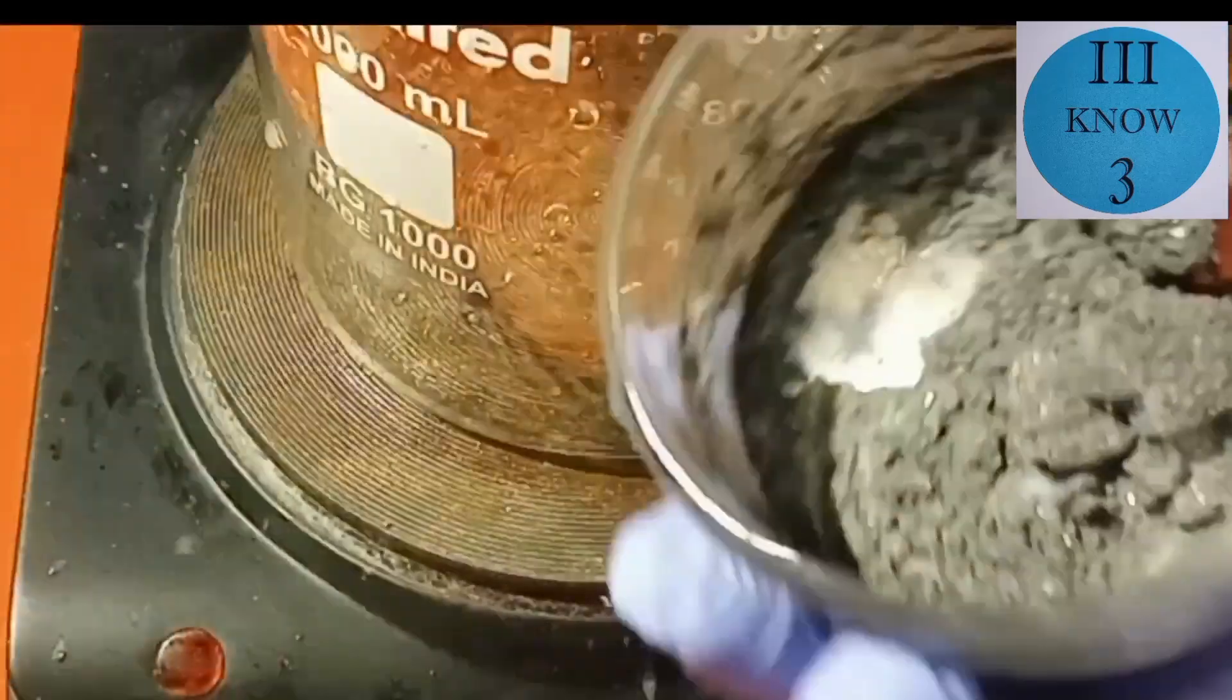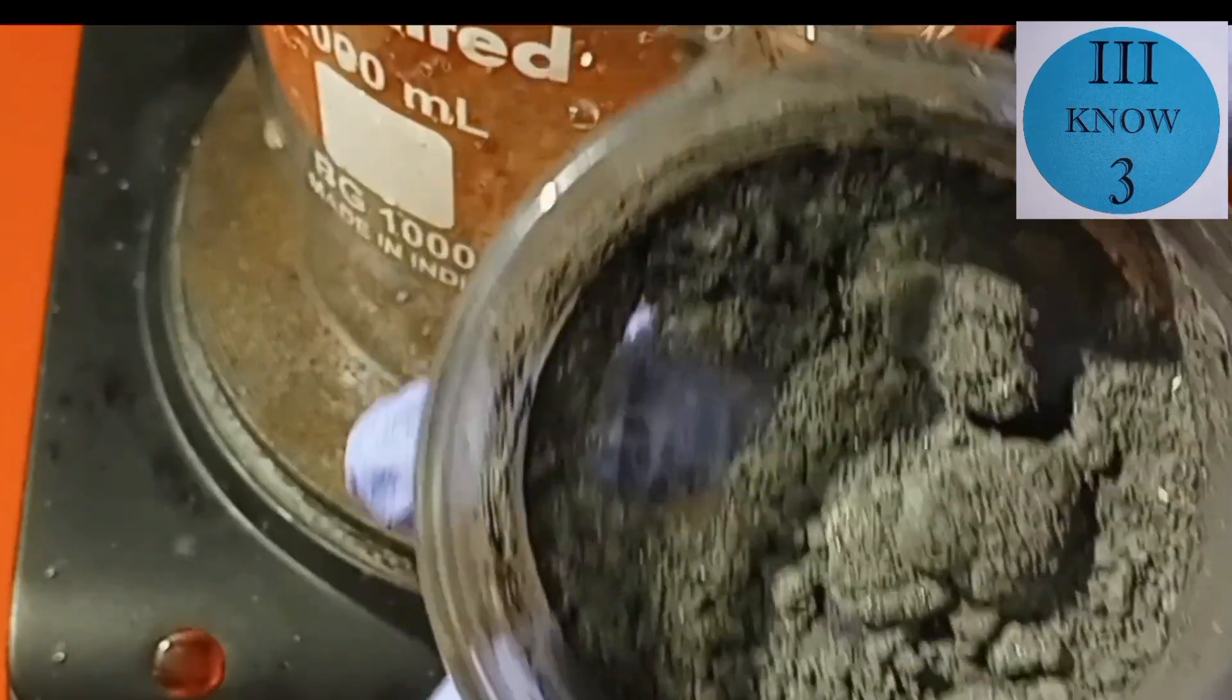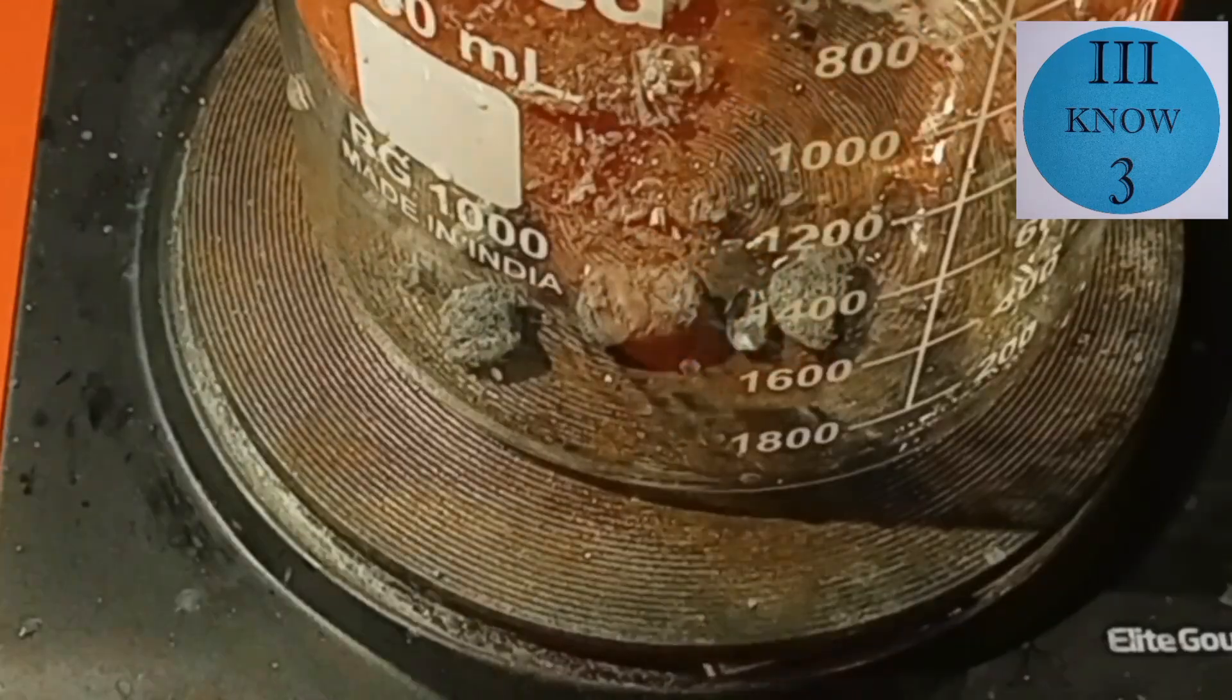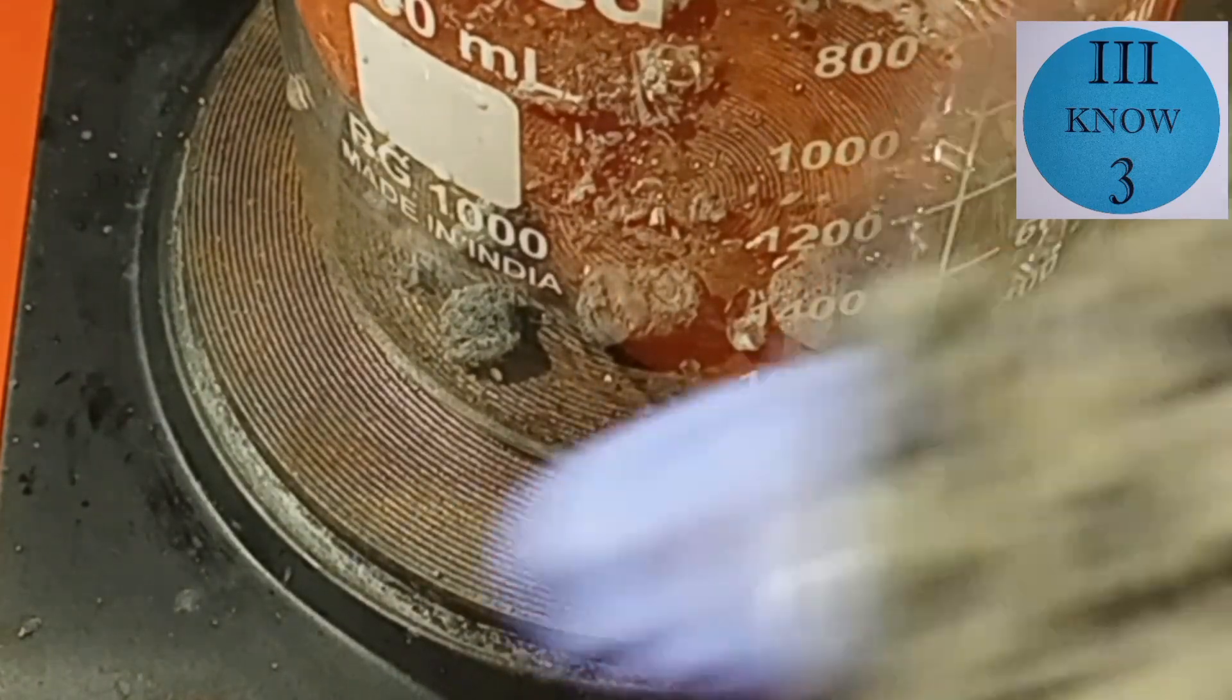This is tin metal that was deposited on the cathode in our tin metal acid and electricity video. And here's a little bit more.